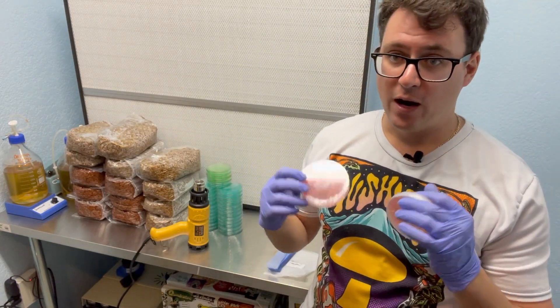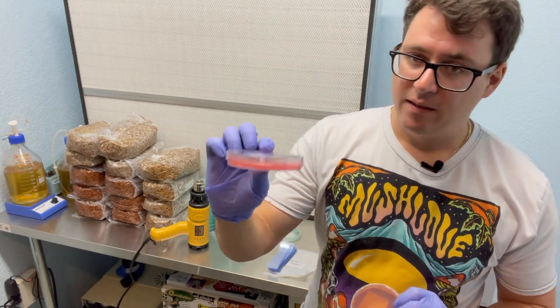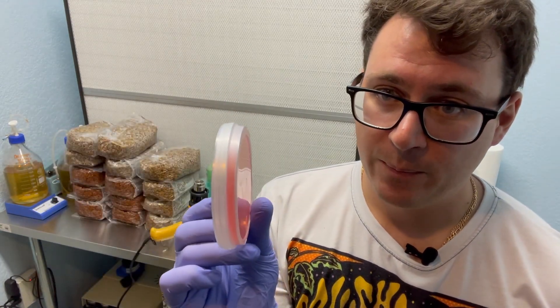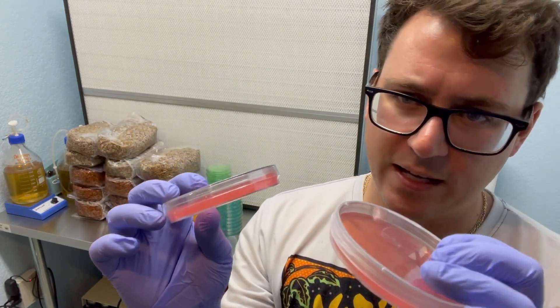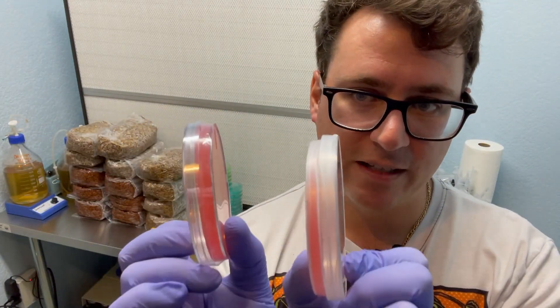For those of you who aren't familiar with Tip of the Cap Mushrooms, they coined this a couple years back — the process of shrink wrapping your petri dishes. If you've seen any of my other videos, I exclusively use parafilm, but I am considering some benefits of the shrink wrap after reading a Tip of the Cap Mushrooms post on Facebook about it, and I decided to do a comparison video.